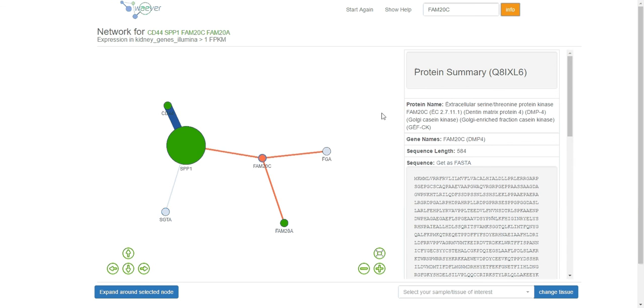So hopefully that's a quick introduction to help you get started with using the tool. If you find it useful, we'd really like to know. If you've got any suggestions for information that you'd like to see or changes to the user interface, we'd quite like to know that too. We've only just released it, but it's fully functional, and hopefully will give you a view of your data that you'll find useful and informative.